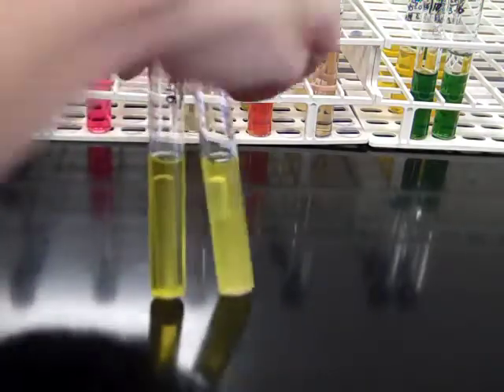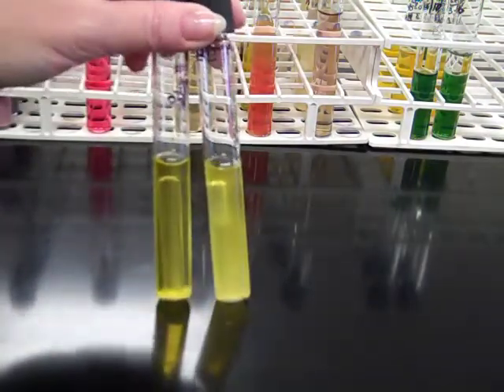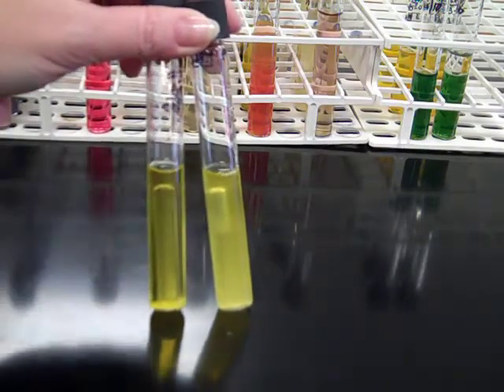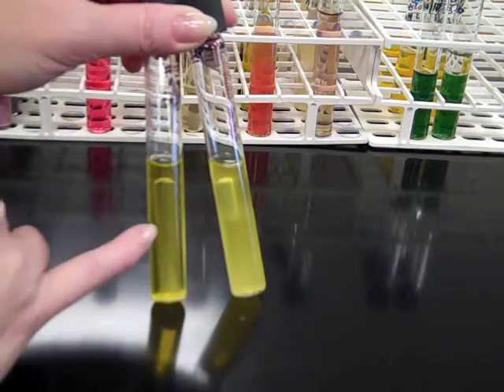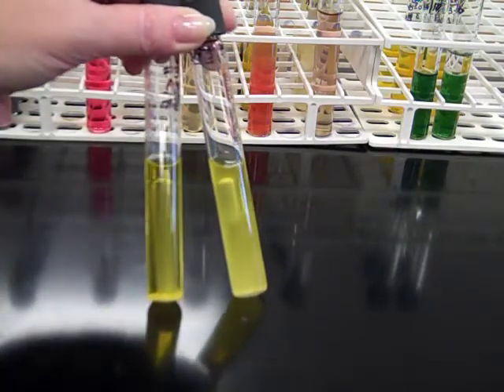Then we look at the Durham tube to indicate whether or not the organism is producing gas. If the organism is able to produce gas, you'll get a bubble filling the Durham tube. Both of these are positive tubes for mannitol fermentation — one without gas and one with gas where we see that bubble.